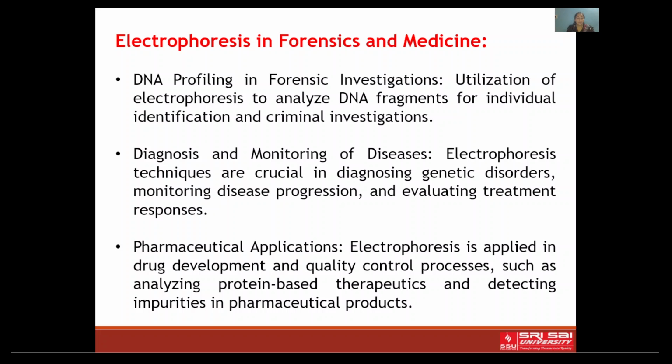In summary, electrophoresis is an indispensable technique in both research and clinical settings. Its ability to separate and analyze molecules with precision has made it a cornerstone in the study of the life sciences. Understanding its principles and applications will empower you to tackle complex biological questions and contribute to advancements in sciences and medicine.